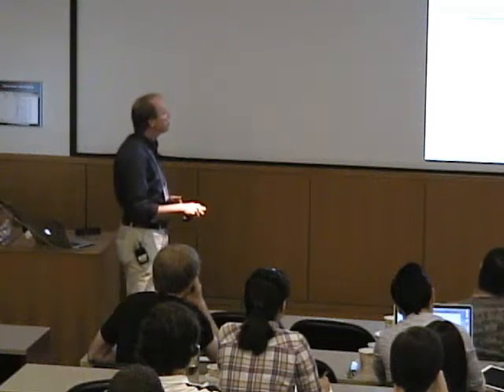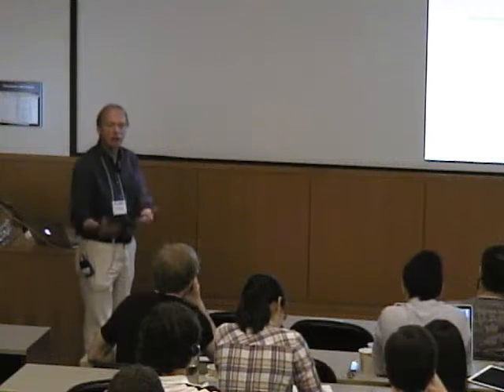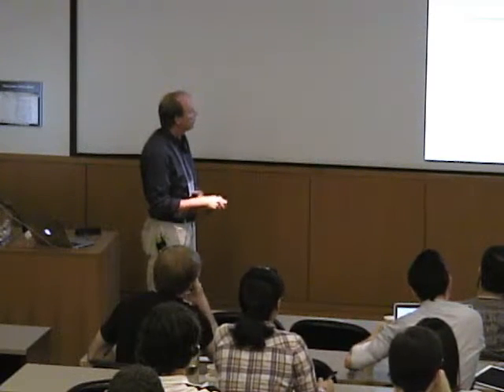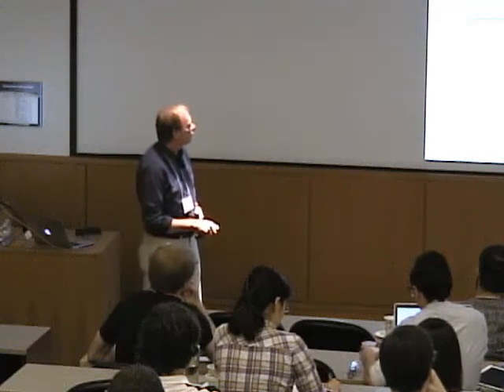And then in between those two, there's one critical position where at the resonance frequency, all of the energy of the microwave stays in the resonator, and there's no reflected power coming back. And this is where we work in an EPR experiment. We lock the frequency, we critically couple the resonator, and then we sit exactly at this frequency. We lock the frequency at this dip, right?